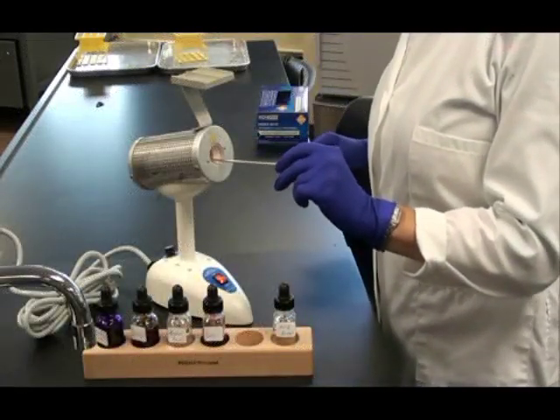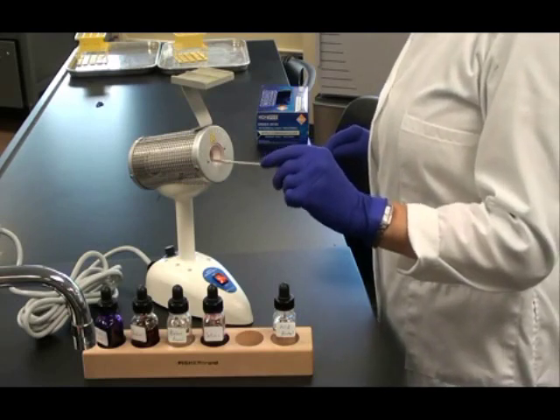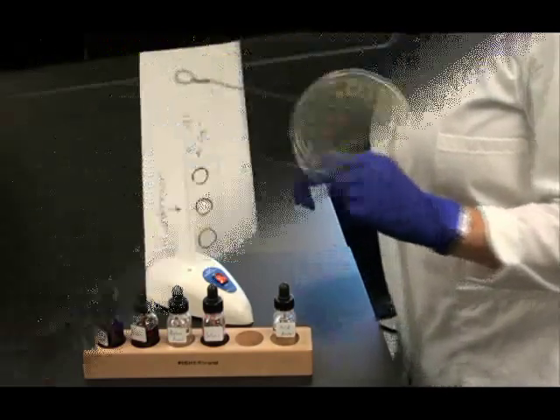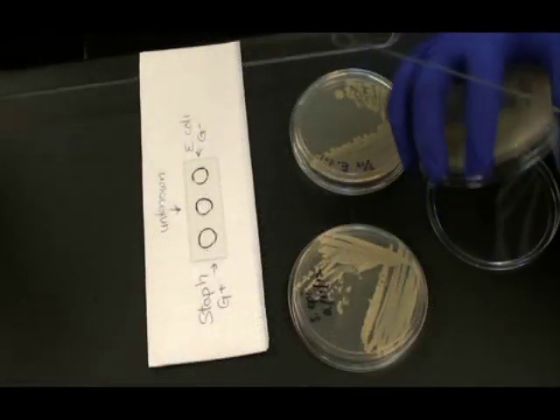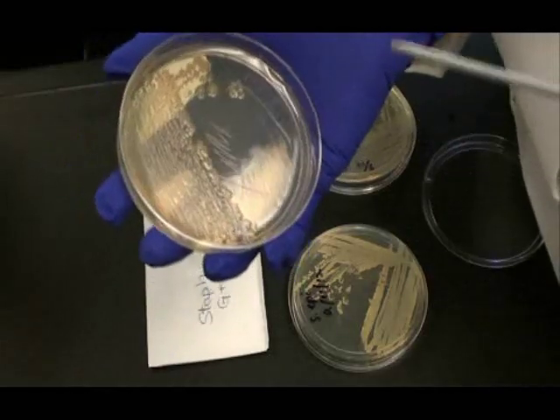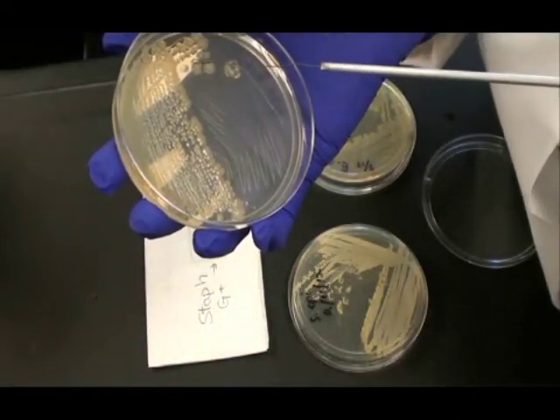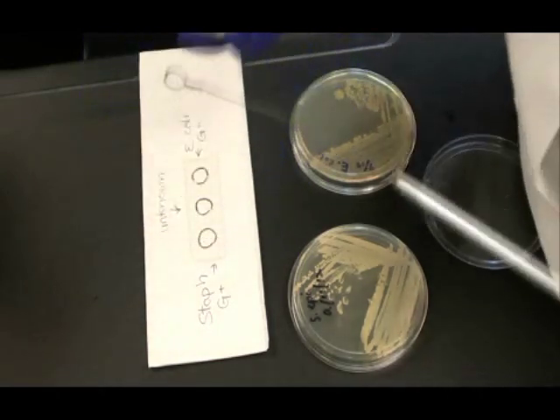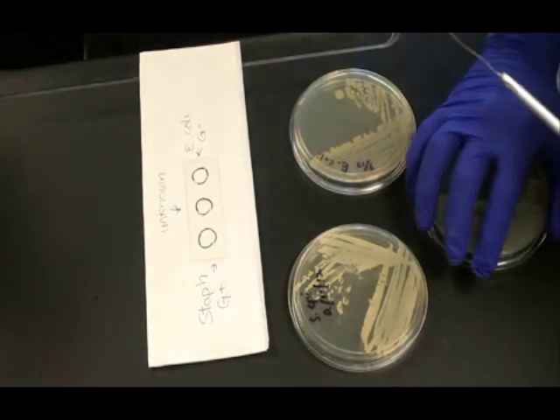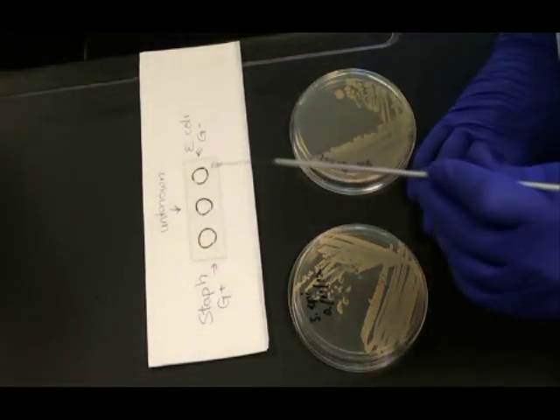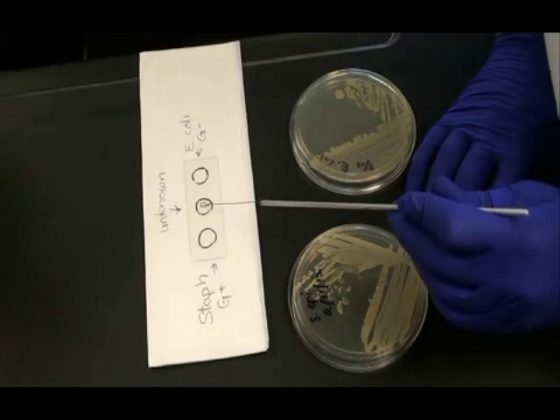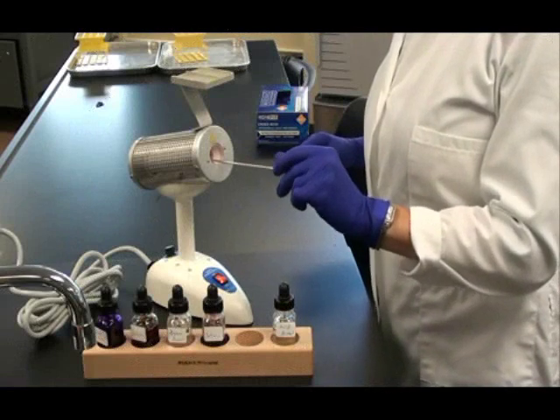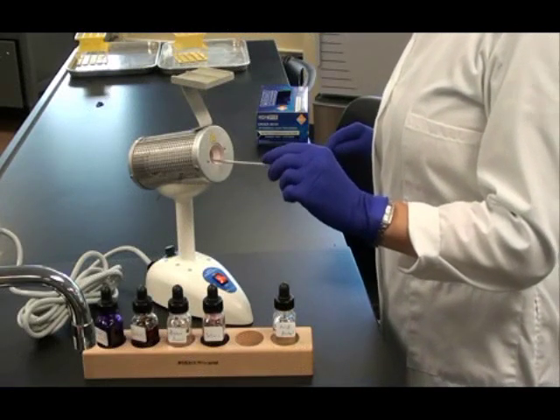I sterilize my loop again in the hub of the microincinerator. Once I remove it and it is cooled, I'm ready to obtain my unknown bacterial sample. So again, I use my cooled loop to gently run it across the surface of the medium grabbing a colony of bacteria. Then I swirl that unknown sample into the water in the circle in the center of my slide. Now I'm ready to sterilize my loop for the last time. I'm finished using it.